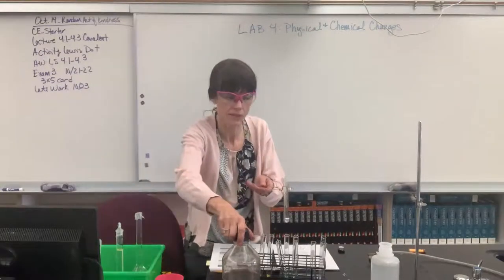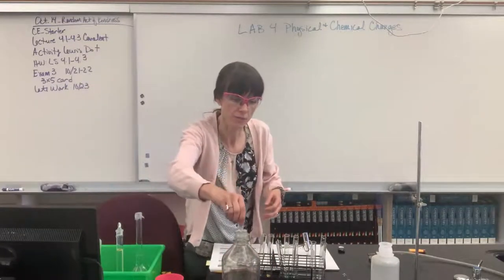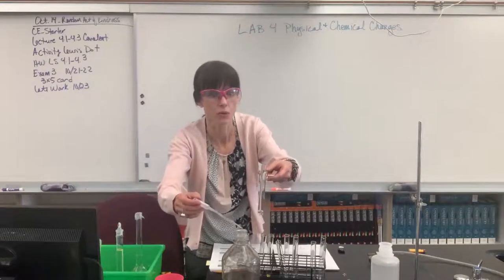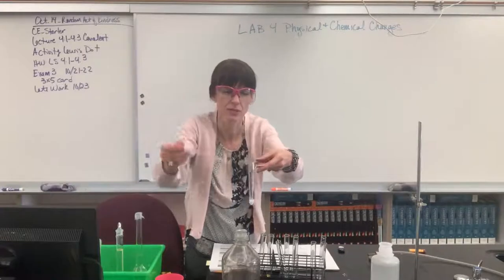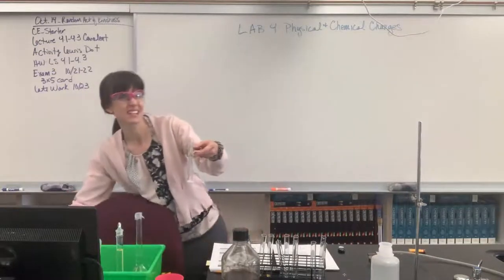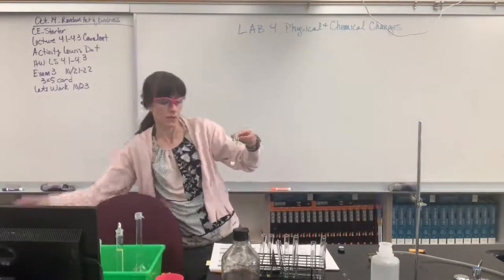And now I'm going to add, let me set this down. I need to open the silver nitrate. Now I'm going to add the 2 drops of the silver nitrate. Okay, remember last time it was white. I mean like crazy fast, thick white. Here we go. 1, 2. Yep, sure enough, there it is. And we have this beautiful white precipitate. Just so you know, that precipitate is silver chloride. Okay, neat. Look at that. Look how white that is against the red. Okay, let's record that.